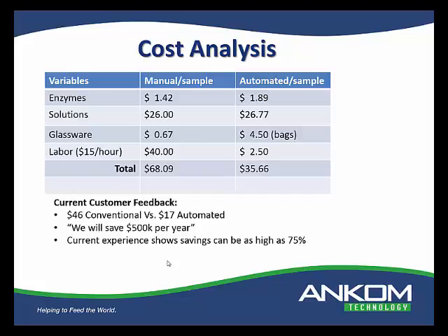I was in a laboratory in Thailand a couple of months ago, and when they did their cost calculations, they were actually figuring in the cost of the water baths for the conventional method, the time in the water bath. They were figuring it to a very high degree, which was quite interesting to see.